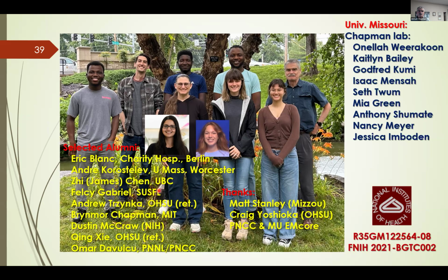And as Paul was emphasizing, when you're doing a difference map calculation, it's pretty important to get the scaling right. And weak signal can just disappear if you haven't got the scaling right. We notice this even more with work that I didn't show today, where we've got the binding of small ligands to the viral surface.